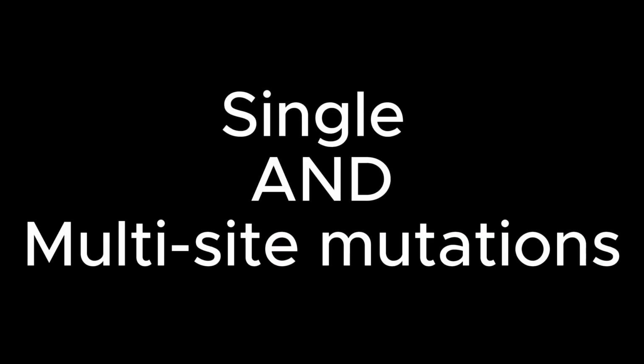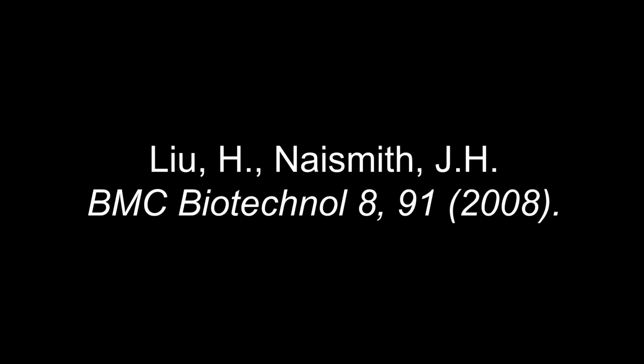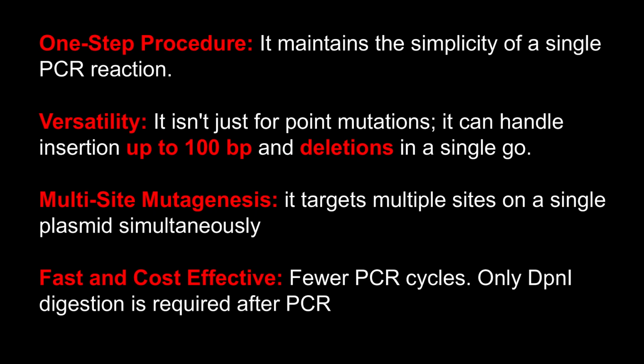If you need a more versatile or budget-friendly route, consider the Liu method. This technique maintains the simplicity of a single PCR reaction while offering incredible flexibility. It isn't just for point mutations. It can handle insertions up to 100 BP and deletions in one go. Perform multi-site mutagenesis, and it is incredibly fast and cost-effective because it requires fewer PCR cycles, and only DPN1 digestion is required after the PCR is complete.